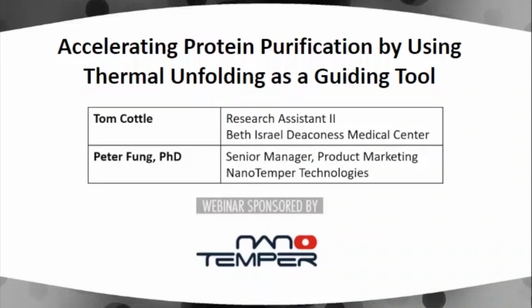Today, our speakers Tom Cottle and Dr. Peter Fung will be discussing generating thermal unfolding profiles on the Tycho system.